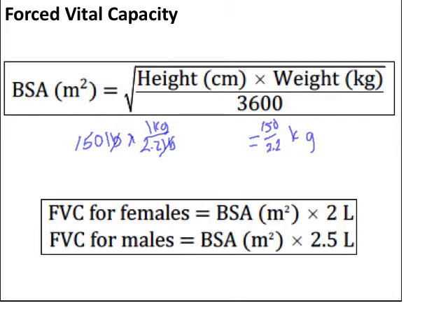Then repeat steps 21 through 23 from your protocol 2 additional times, recording each trial in data table 4. Record the largest circumference of the 3 trials in data table 4 next to largest circumference of trials. In all of these measurements, you want to make 3 runs and take the average, and the reason for that is to correct for random error.